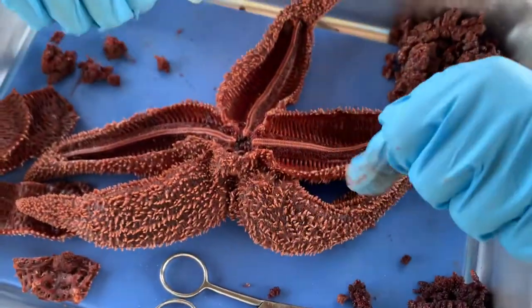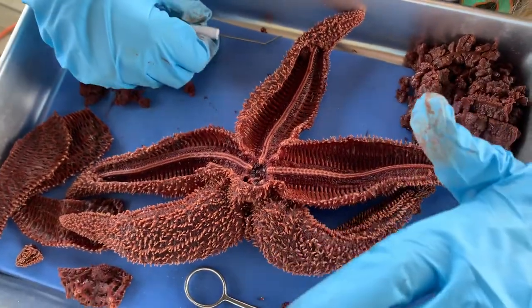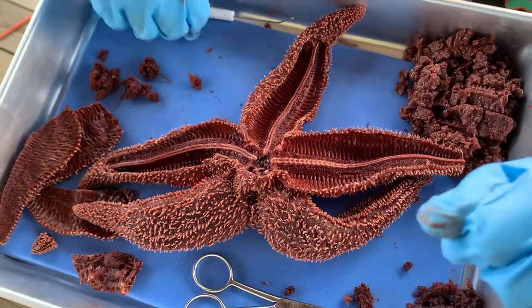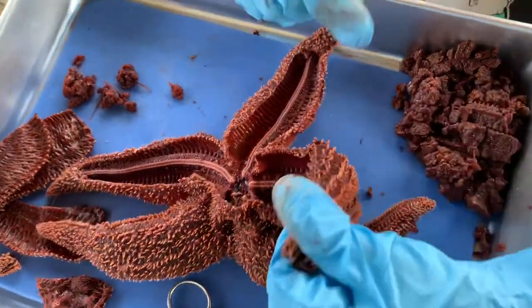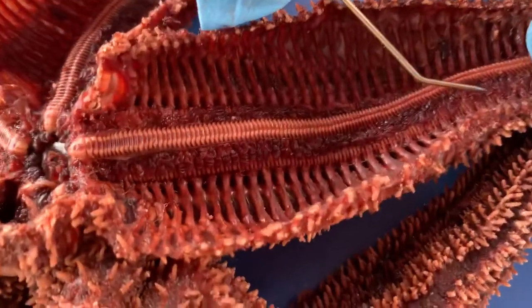The ampulla is the bulb on top of each tube foot. So as you can see, these are the tube feet, and then these are the ampulla.